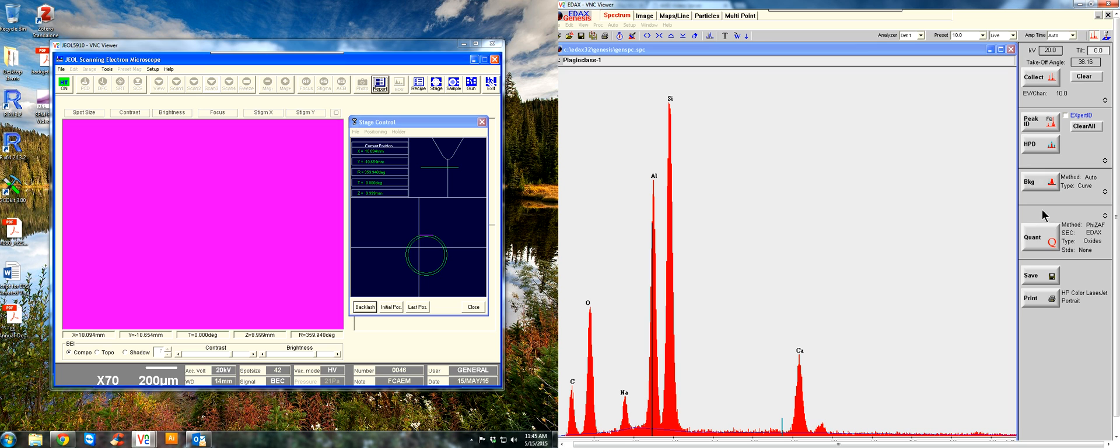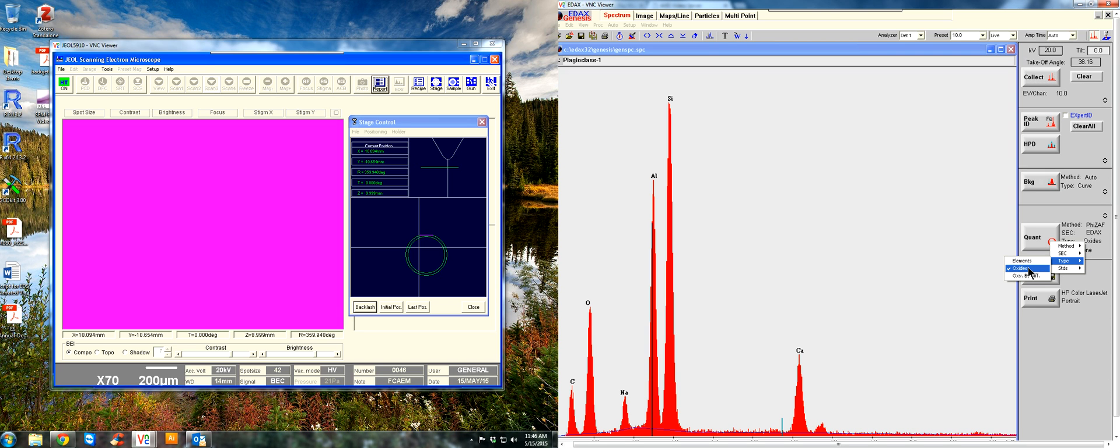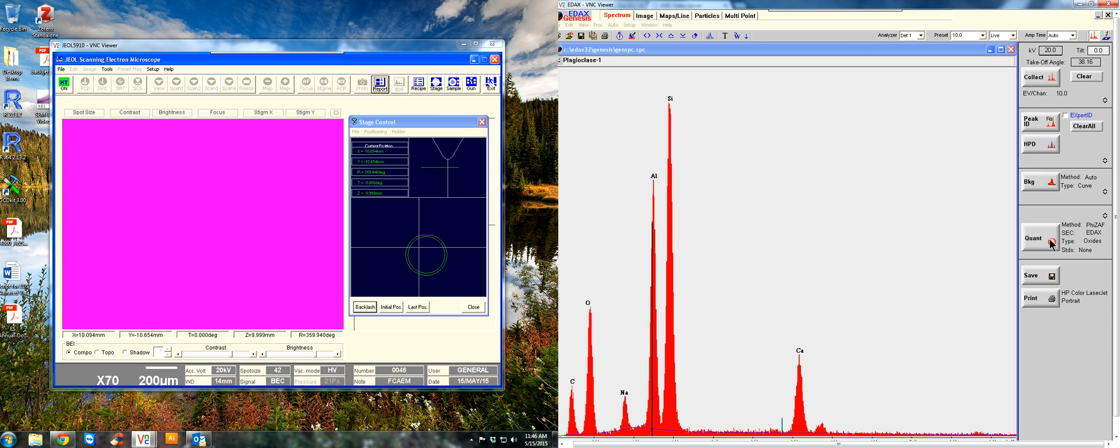And here, under quantification, you get to choose your method. If you right click in this area, you can choose ZAF correction method, which is basically an atomic number correction, atomic absorption correction, and a fluorescence correction. And you can also change the type of if you're doing pure elements or oxides. In this case, we're doing oxides, so we'll click on that and ZAF correction. We're not using standards, so we'll hit quantify here.